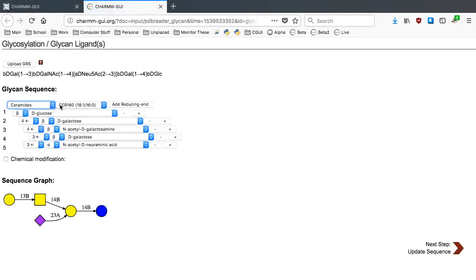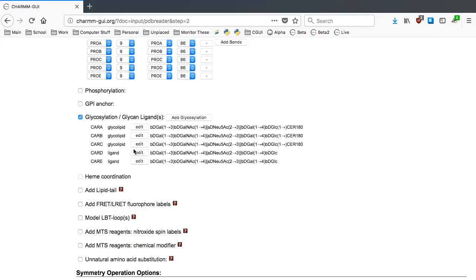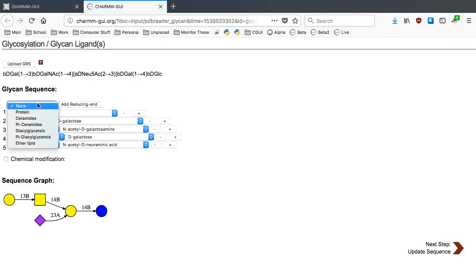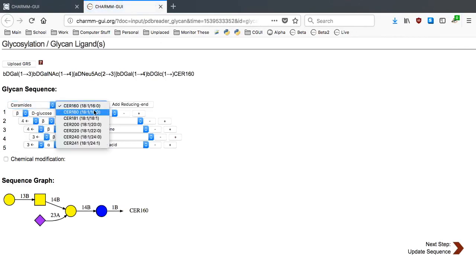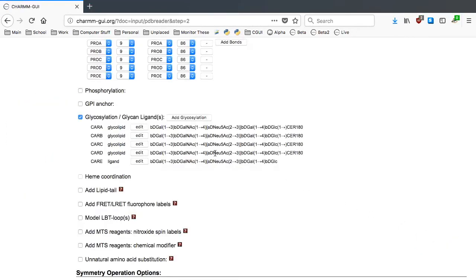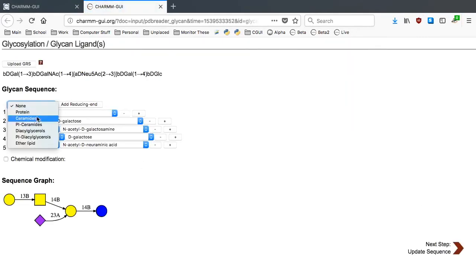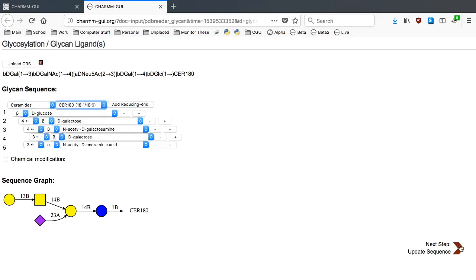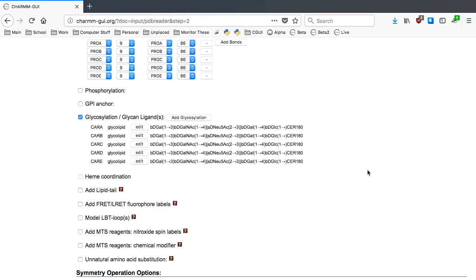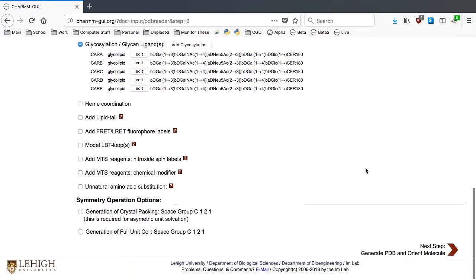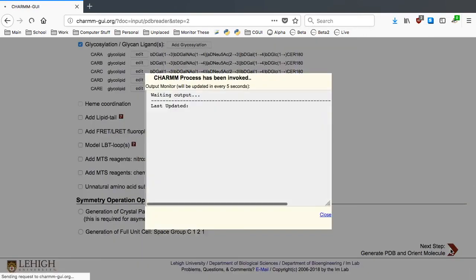For Carbohydrate B, D and E, just add the ceramide 180 to build a complete ganglioside GM1. Once everything is done, click Next Step to orient the model in a bilayer.